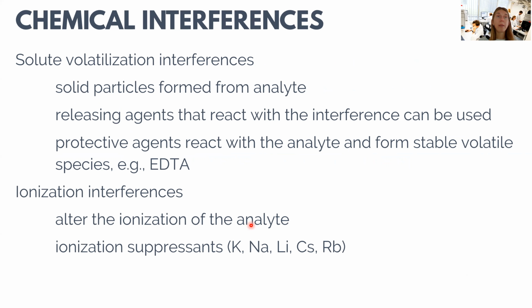Important are also chemical interferences, and the simplest one are solute volatilization interferences. So these are species that are forming some very, very stable complexes with our analyte, and these complexes are not volatile. So in this sense, atoms of our analytes are not released from these particles.